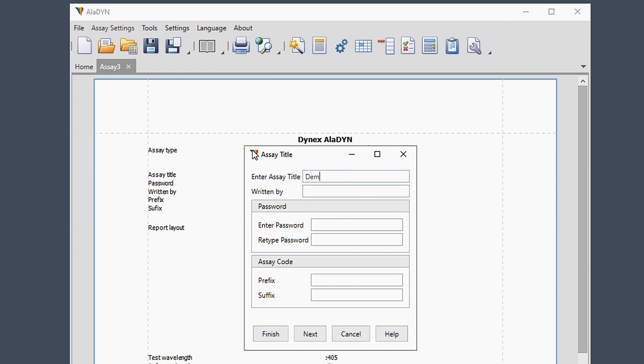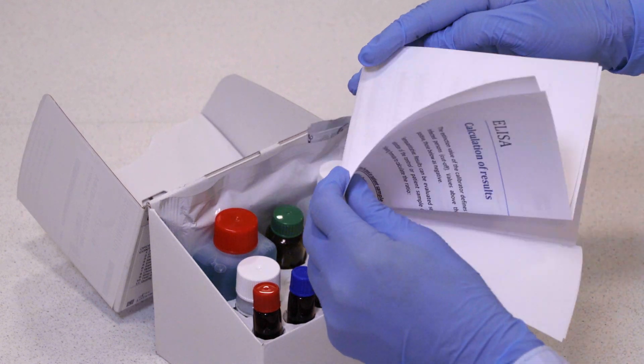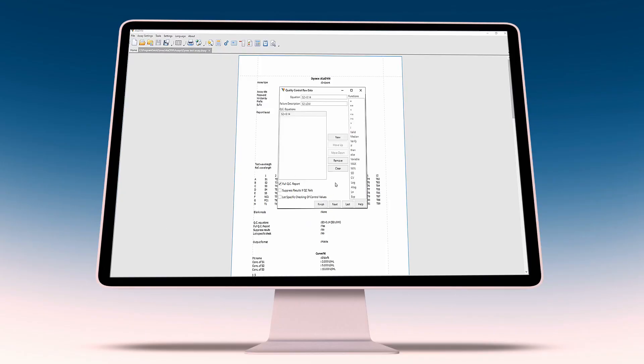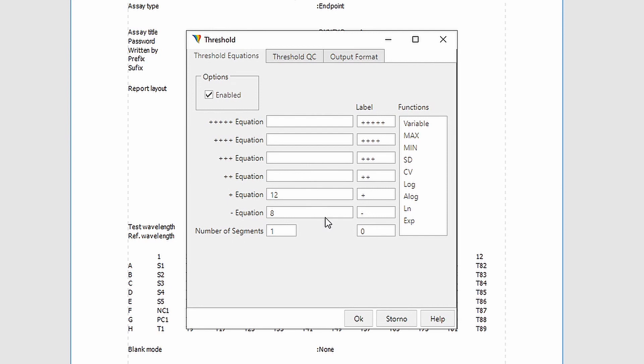After setting the header, reading options, assay template layout, and raw data quality control, you can define calculations for further data processing. You can set the mathematical model which is often used for ratio function, or specify the threshold equations of your qualitative and semi-quantitative assays.